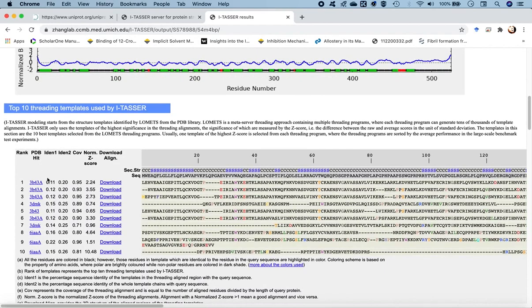And these are the PDB hits that you get with the PDB IDs and the corresponding chain IDs against it. So these are the three chain A's and then chain K and then chain A. So the first 10 hits, and you can download the alignment with our predicted protein structure with these templates. And the secondary structural features for these hits are also given out here, which should ideally closely correlate with the predicted structure from our sequence.